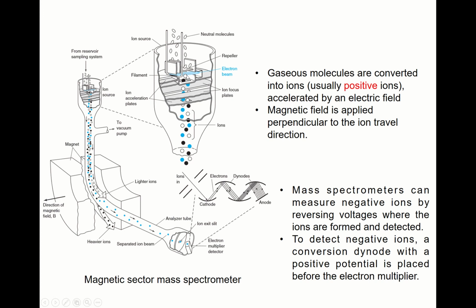Okay, and then these ionized molecules or fragments now pass through this plate, and here some voltage is applied, okay, and then these ionized species are now accelerated, yeah?